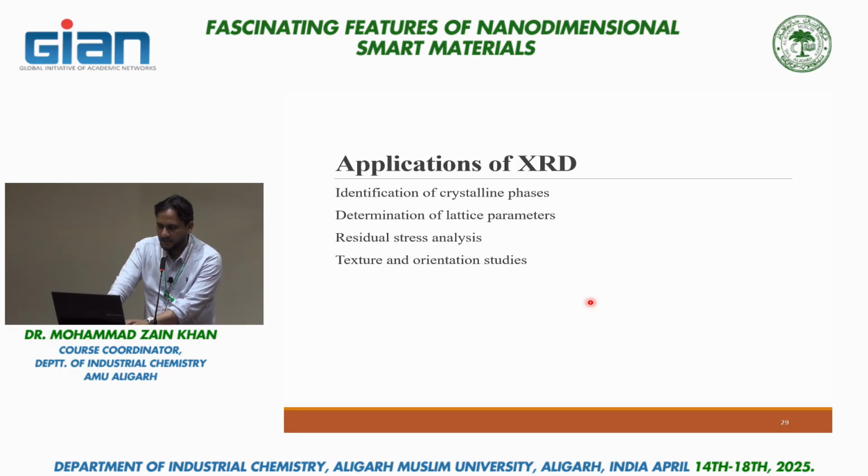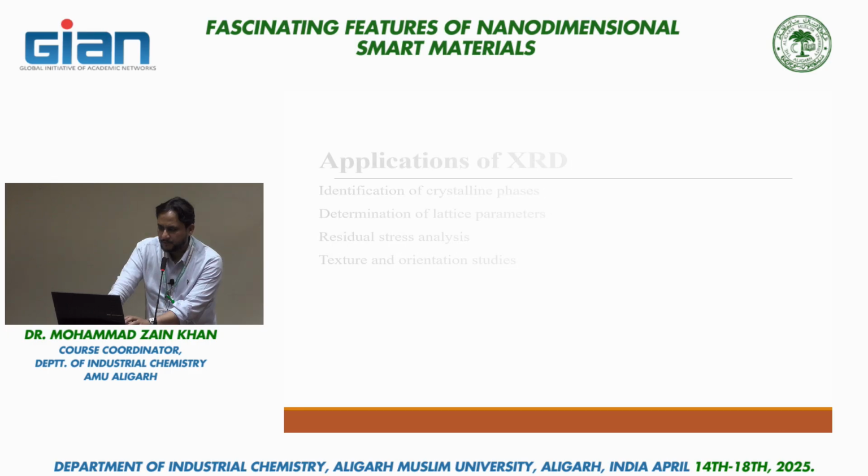I think I am running out of time. These are the applications: studying the morphology, the crystallinity, the particle size, even orientation studies also.